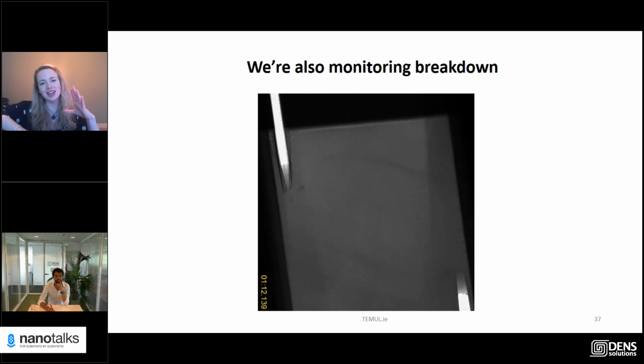The minute I do the J cut, it's gone. It's not like with other types of ferroelectric materials, where what is in the bulk is normally what's in the FIB lamella. With this, I need to pretend there's no point looking at the bulk material, because it's totally different in the FIB. Okay, yeah, clear. It's a tough sample to trace.